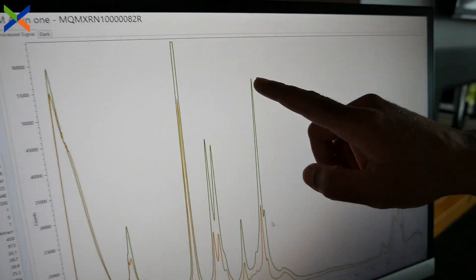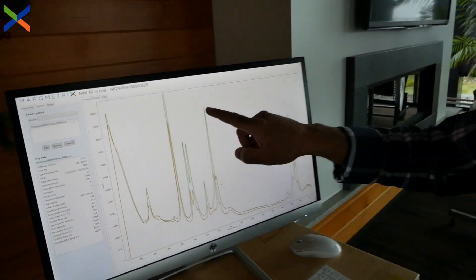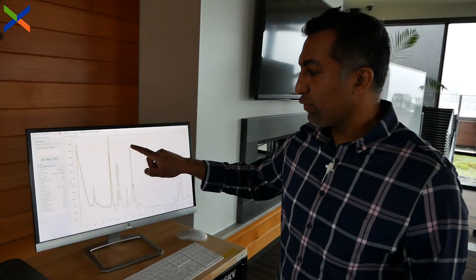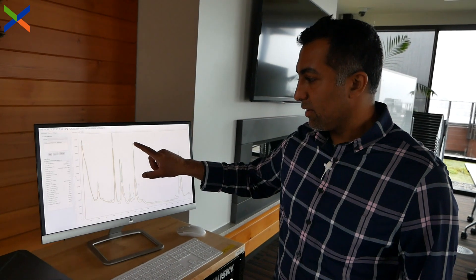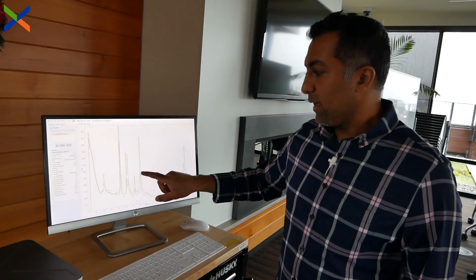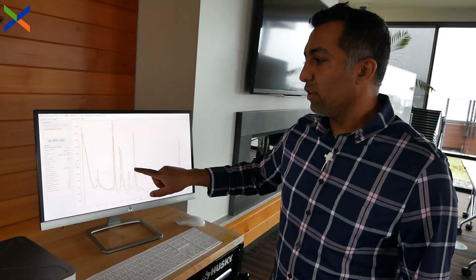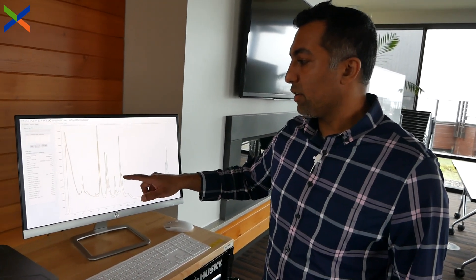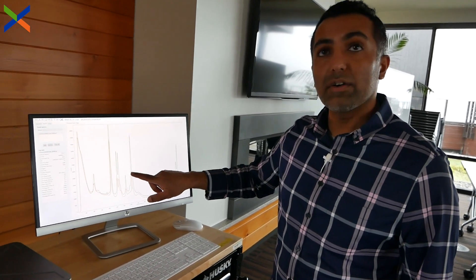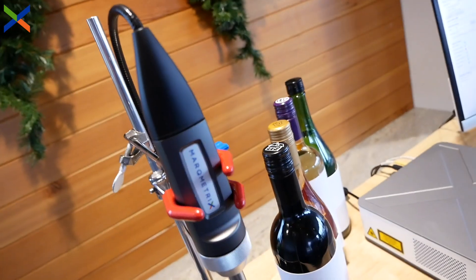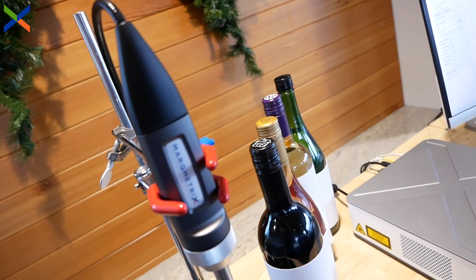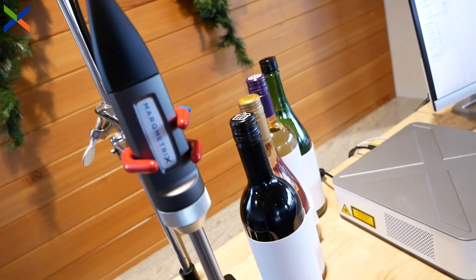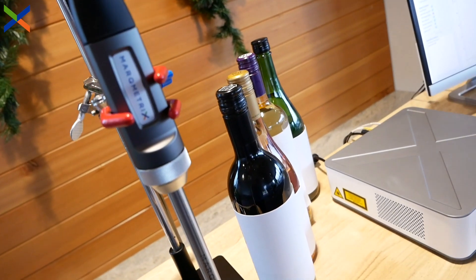Just to compare, let's add a spectrum of the sake. You can see that the ratio of this peak to this peak tells us the amount of alcohol in sake. If this reference is 40%, then the sake has a lot less — probably around 10 to 12% alcohol.